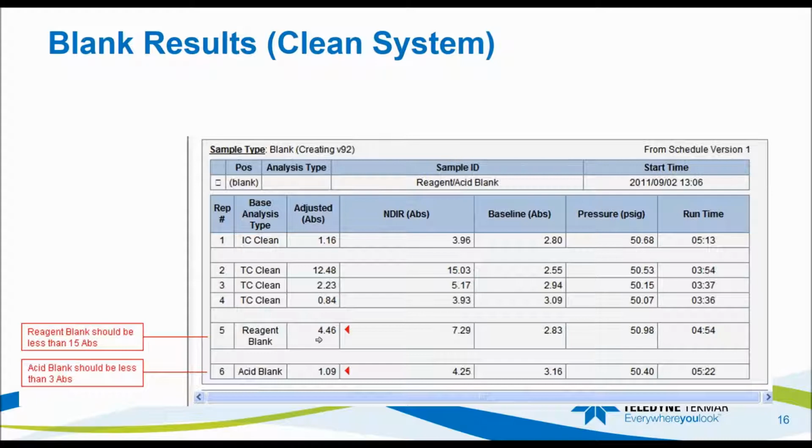It's much less likely to get it from your phosphoric acid, but it can happen. It could even be the jar that the solution is in could be contaminated. Maybe it wasn't washed well, something like that. So just keep that in mind and keep an eye on that as you run the Fusion.